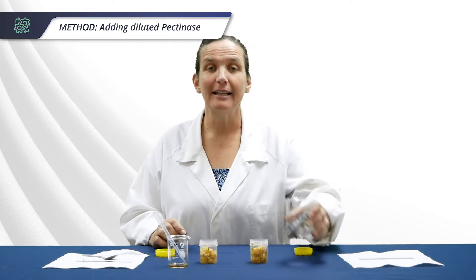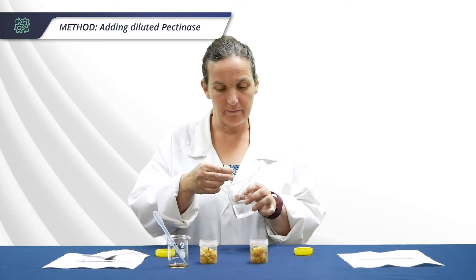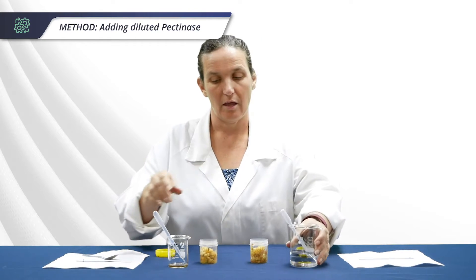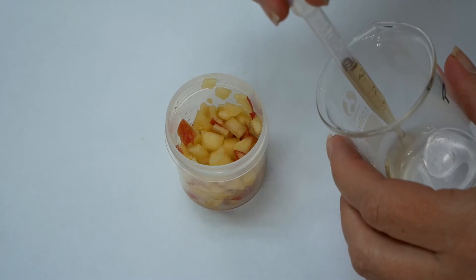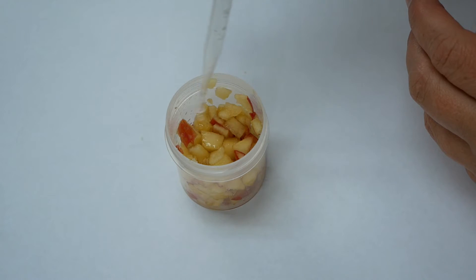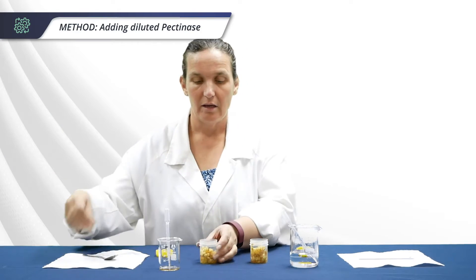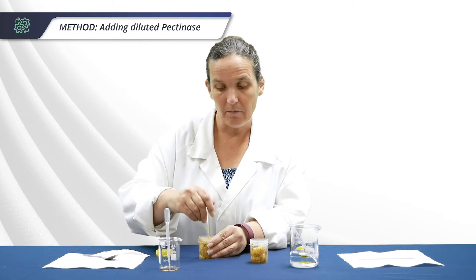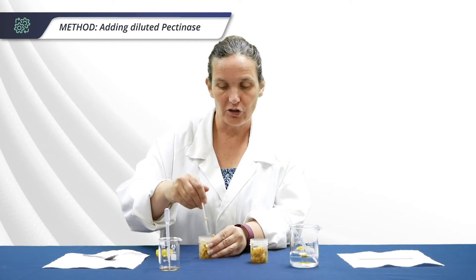Into your control vial add two mils of water, and into your experiment vial add two mils of the diluted pectinase. Give them a stir. Be careful not to mix up your glass rods, as you don't want to get any enzyme into your control vial.